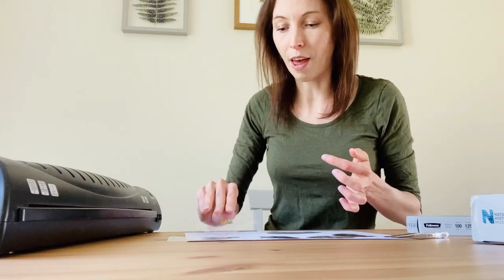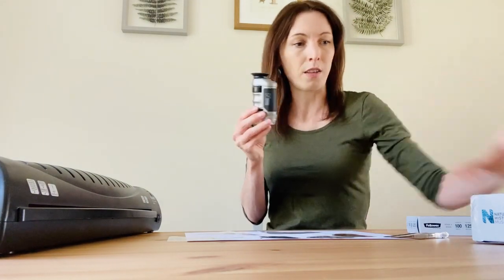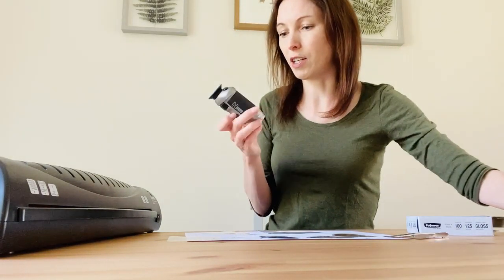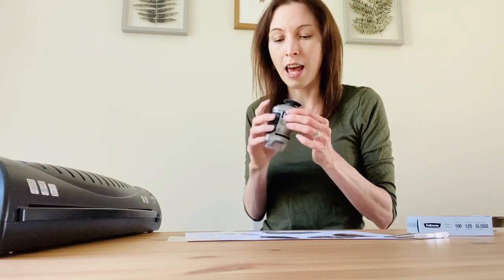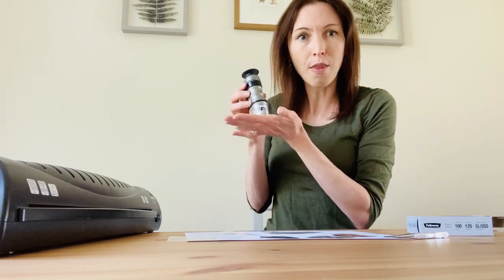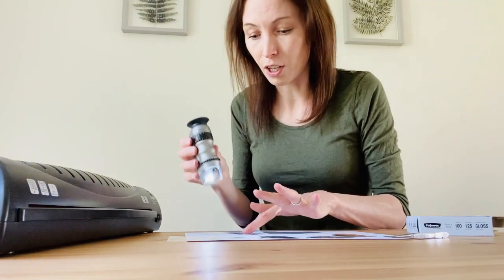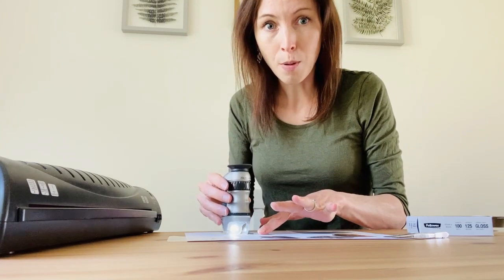Once you've made your microscope slides you're going to want to have a look in detail at what you've got. There are loads of pocket microscopes available and you don't have to spend a fortune. I just use these ones from the Natural History Museum — they're battery operated, you put four batteries in, and there's a simple light switch at the top. It did come with an attachment at the bottom that you can slide a slide into, but I've lost mine and that doesn't matter because you can just pop the microscope directly on top of the slide.